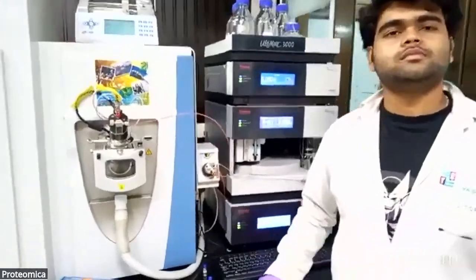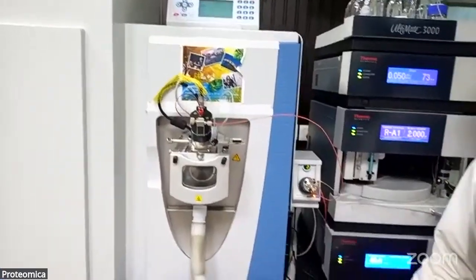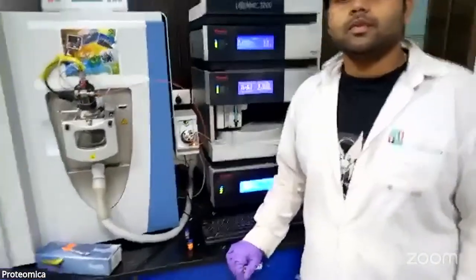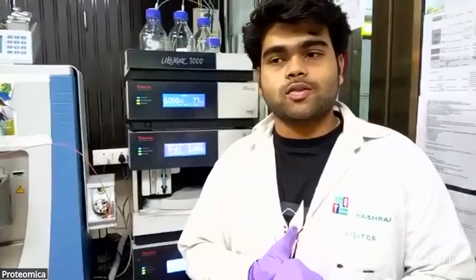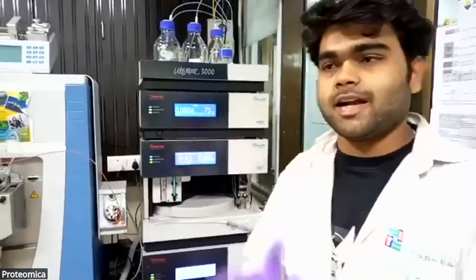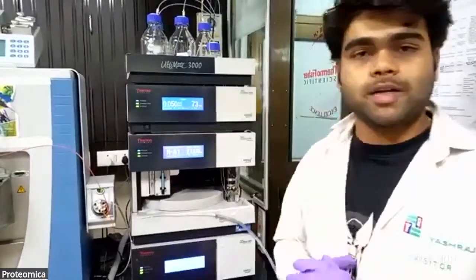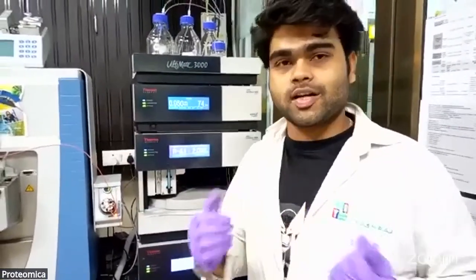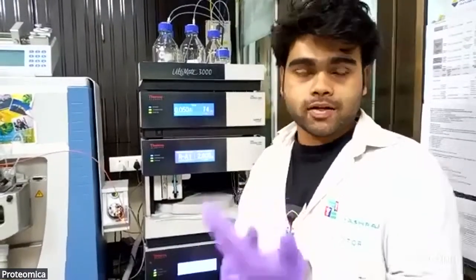We have a 3000 series HPLC which is connected with the Orbitrap Q Exactive mass spectrometer. Now I request Amit to explain. As you have learned about proteomics, there you need to chop the proteins into peptides, but it is not the same for metabolomics and lipidomics. It's very straightforward. With only chilled methanol and so on, you can extract the entire lipidome and metabolome from the serum or tissue samples, the similar samples that you have used for the proteomics.